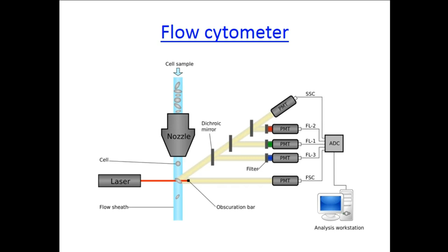So the blood with the mixture of cells gets put into the flow cytometer. It's streamed into a single cell solution, and this then is exposed to a laser. The cell deflects the laser in a characteristic way, and the light is deflected and detected by detectors. The detector then transforms that signal into an electrical signal, and that's what you see in the computer.